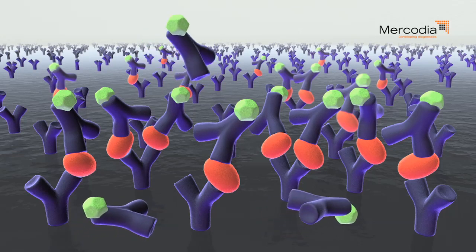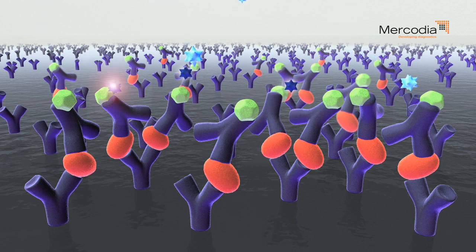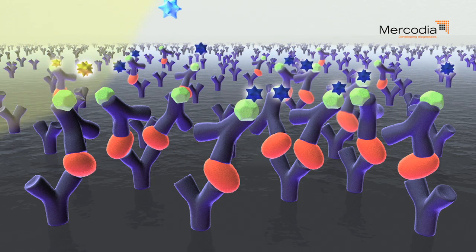Unbound antibodies are removed by a washing procedure to avoid background signal produced by interference. Substrate is added, which is converted by the enzyme to a chromogenic signal.